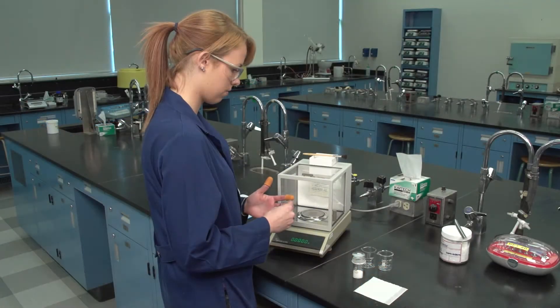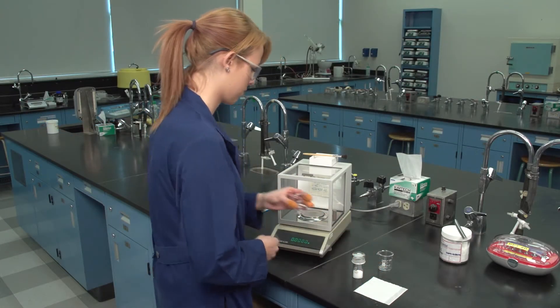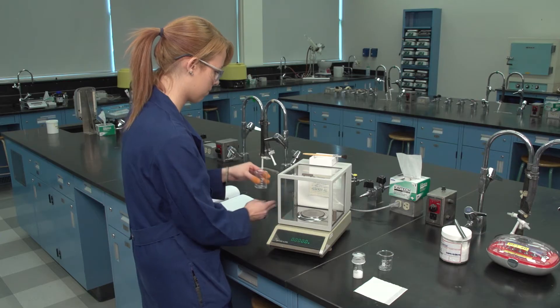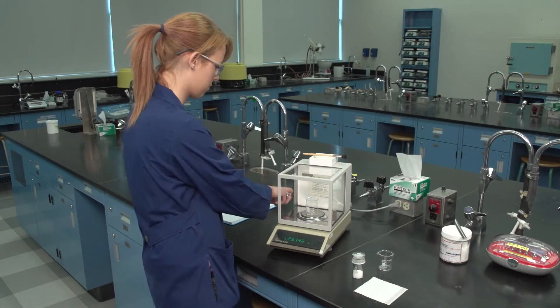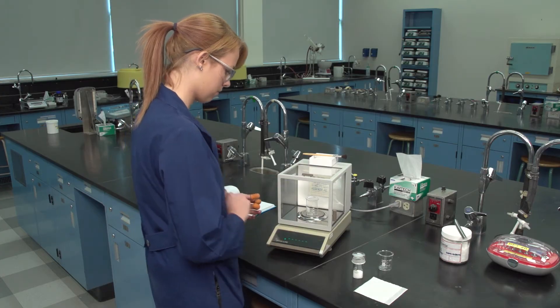Without touching with bare hands and using finger cots or lint-free tissue, place a clean, dry weighing bottle or other suitable weighing container on the analytical balance. Close the compartment door. Press the tare bar.